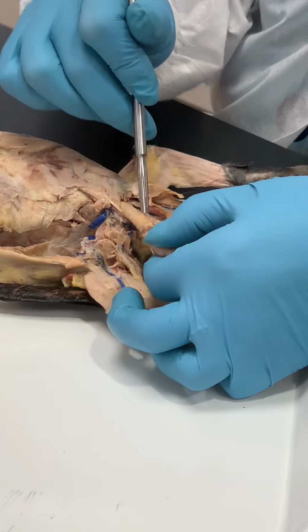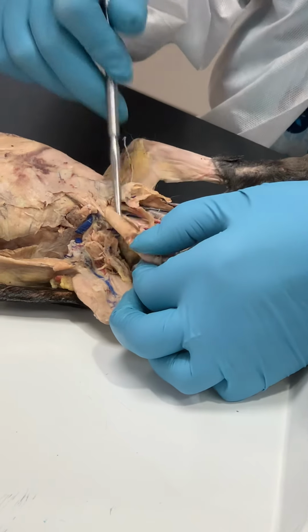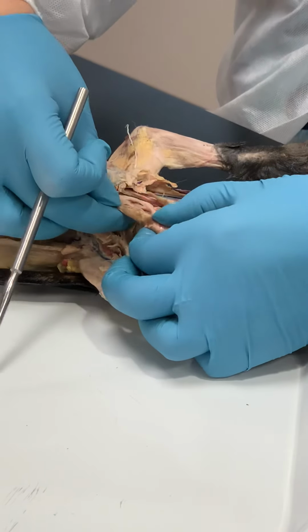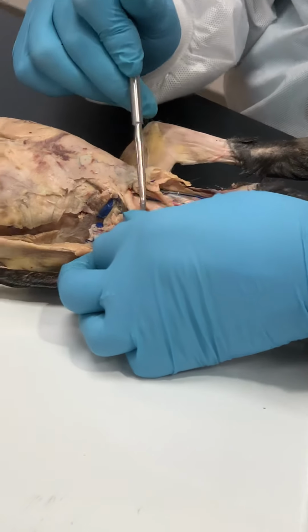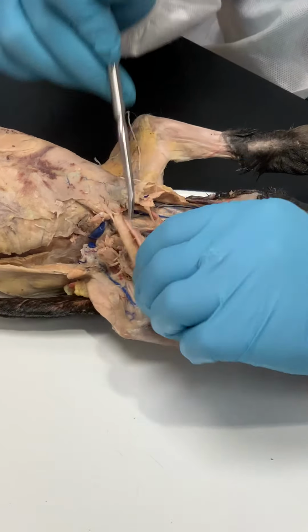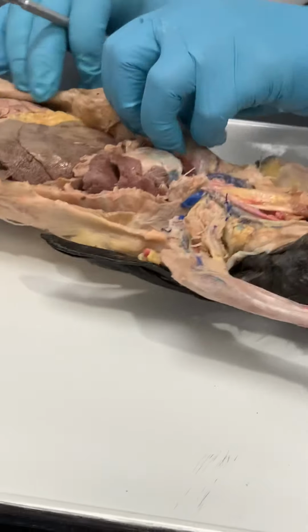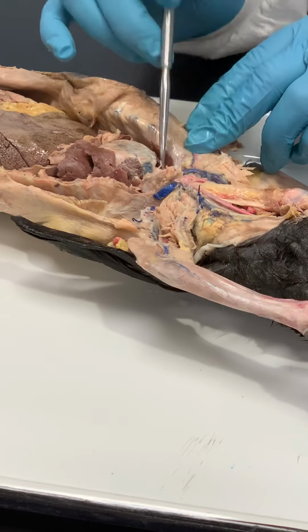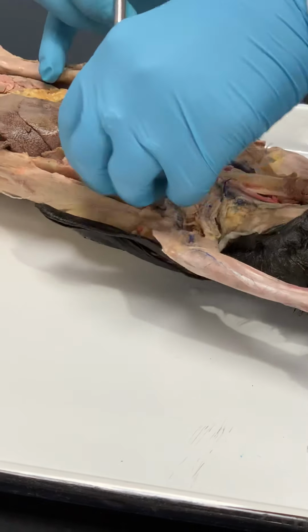Behind it is the esophagus stuck to it. Okay, so they're usually stuck like that together. And you can see behind here that muscularis muscle too, if you get a good look at it. Right back in here, the C rings end. Okay, I'm not going to show you where it bifurcates. I'm not ripping out the heart to show you where those bronchi show up. You get the idea. Okay, underneath the heart, you're going to see that bifurcation.